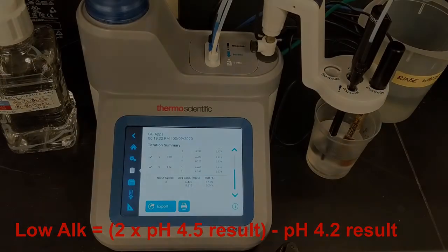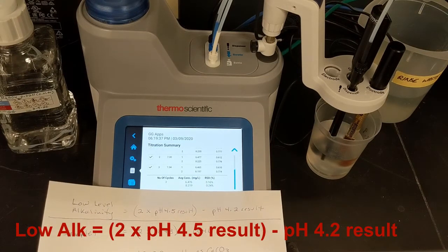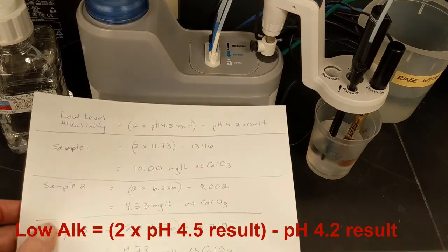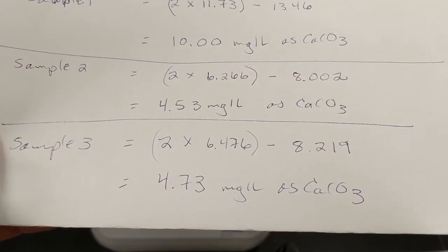From the average results, I can calculate the low-level alkalinity as 2 times the pH 4.5 result minus the pH 4.2 result, which is 4.73 mg per liter as calcium carbonate.